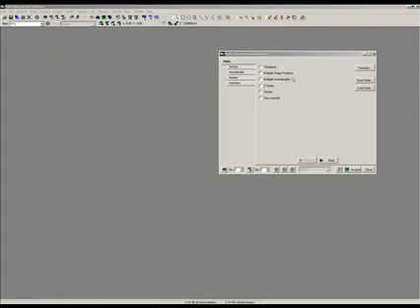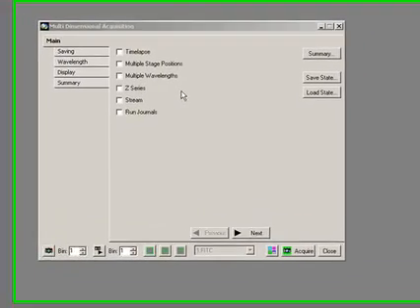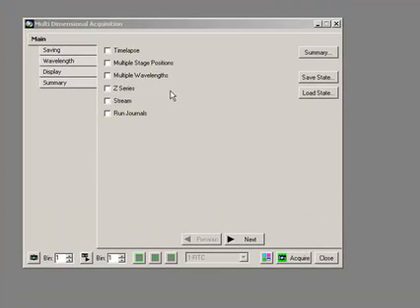This is a quick movie showing you how to do a stream movie or stream acquisition inside Multidimensional Acquire in Metamorph. Streaming is the ability to go as quickly as the hardware or the camera will allow you to do.